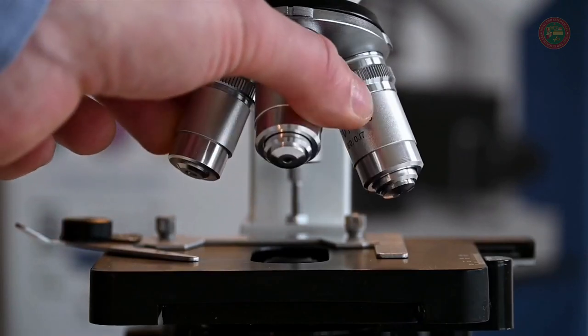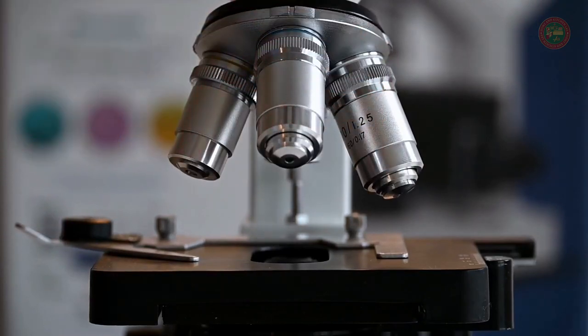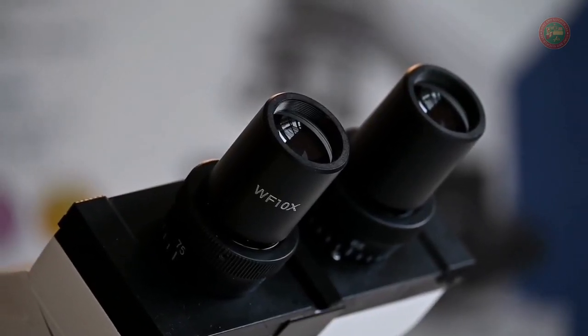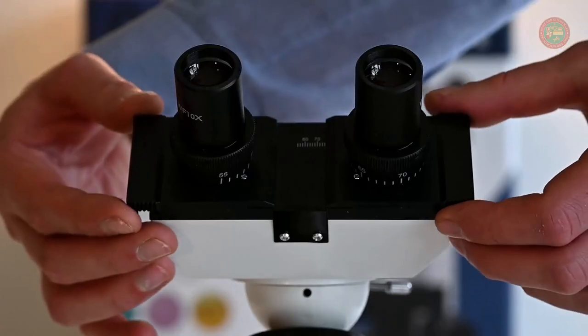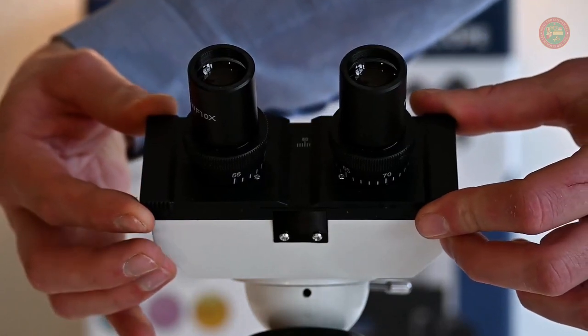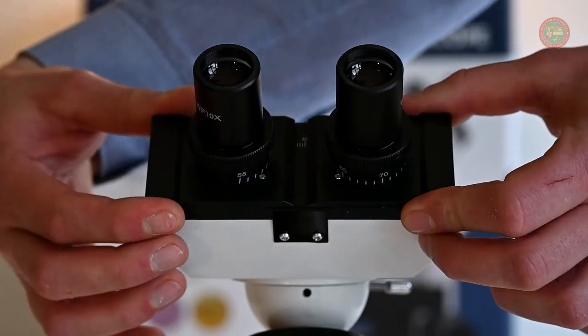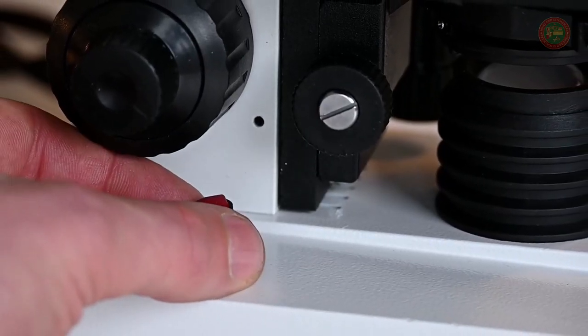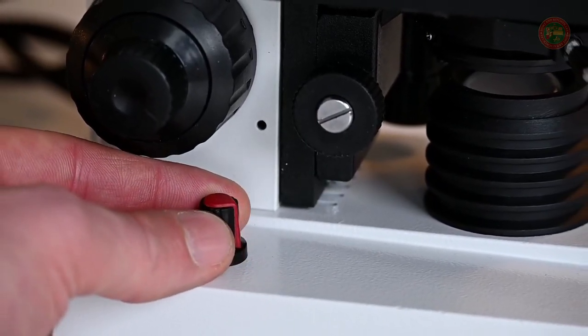Always start at the lowest magnification, which is the 4x objective. Now you can take a look through the eyepieces. To adjust the distance between the eyepieces, simply slide them apart or closer together for the best view. The light intensity is controlled with the dimmer on the side.